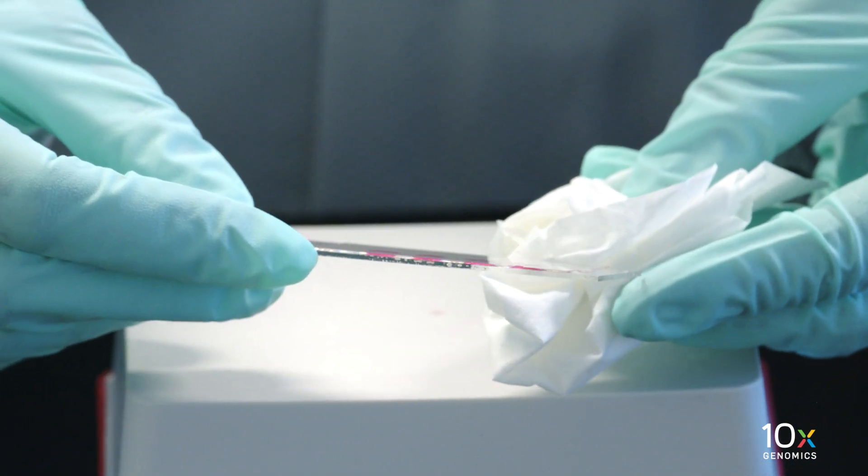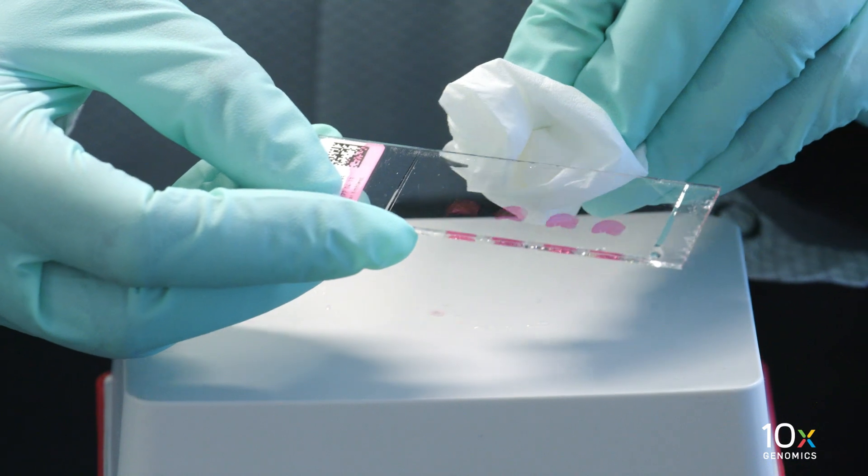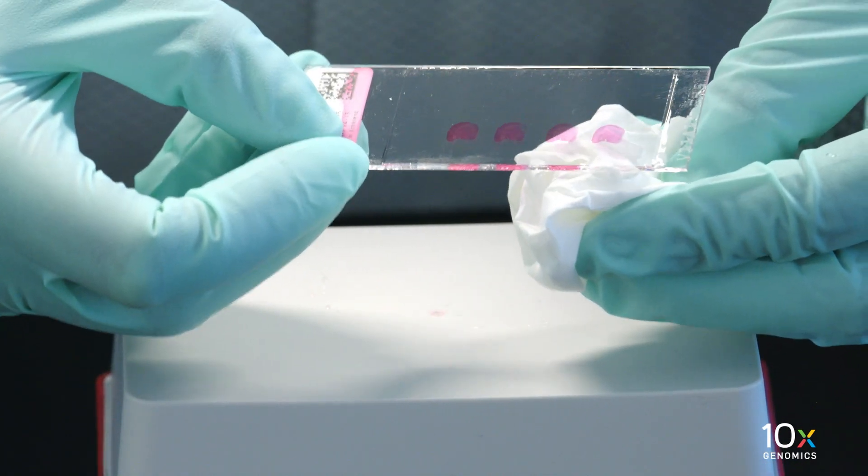If needed, remove any large excess of glycerol by carefully wicking away from the edge of the cover slip with a laboratory wipe. Be careful not to move the cover slip and disturb the tissue.